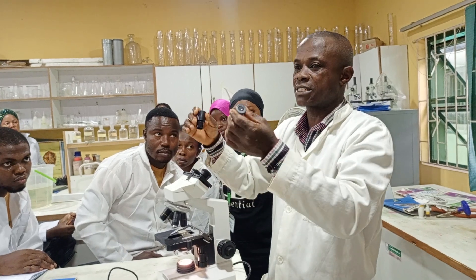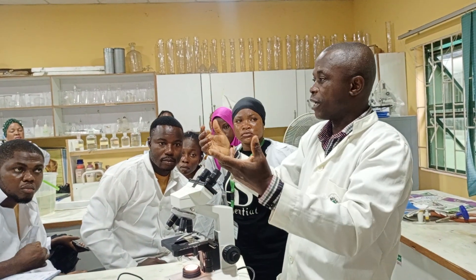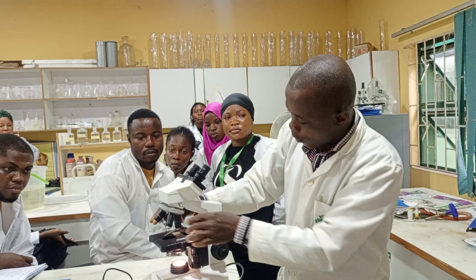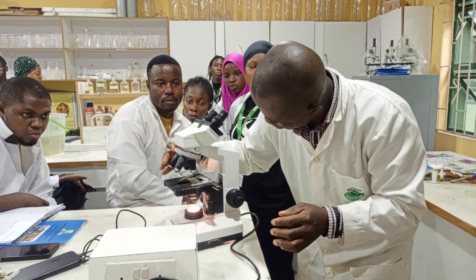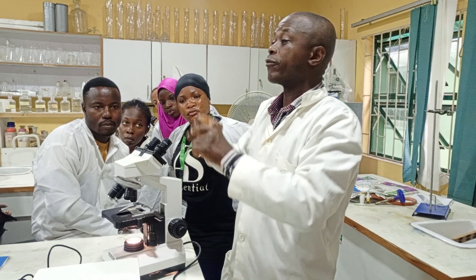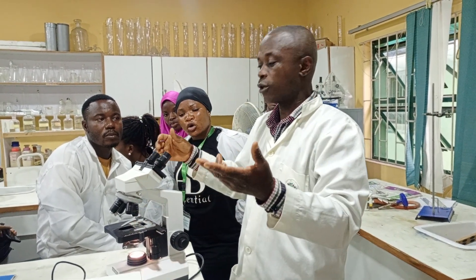the eyepiece has a series of lenses that magnify the microscopic specimen into something you can see. The objective lens also has lenses that magnify. For example, if I want to use a times 10 objective and I have my eyepiece as times 10, then the magnification is going to be 10 times 10, which equals 100.